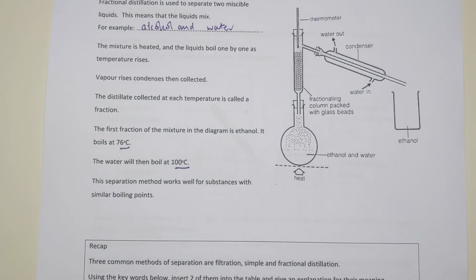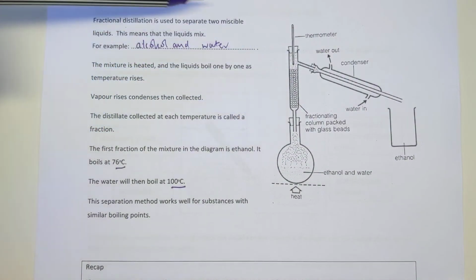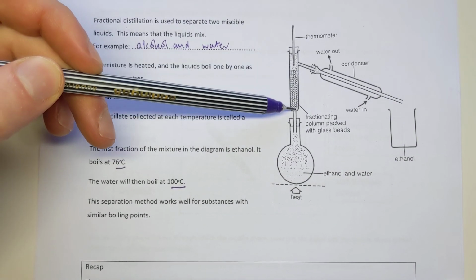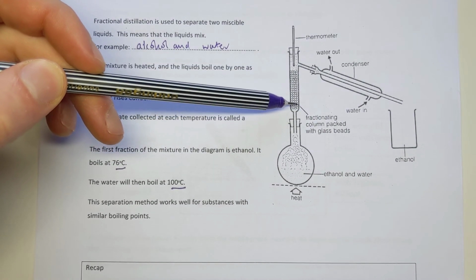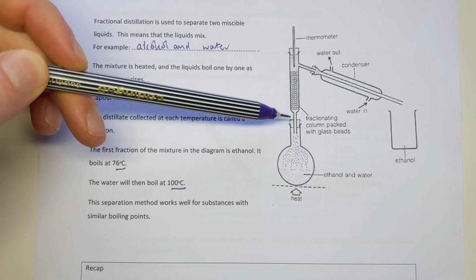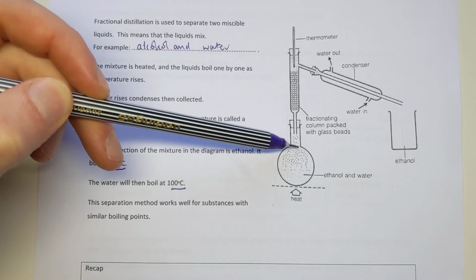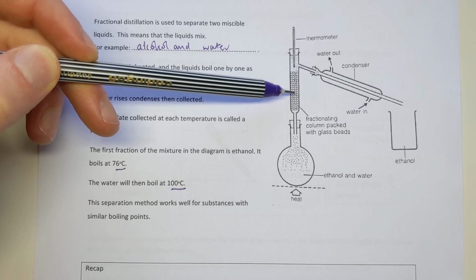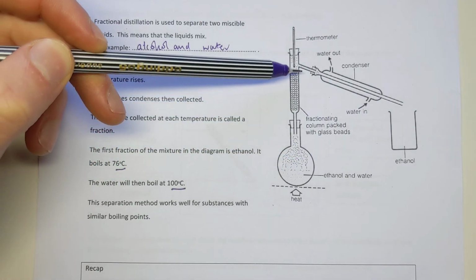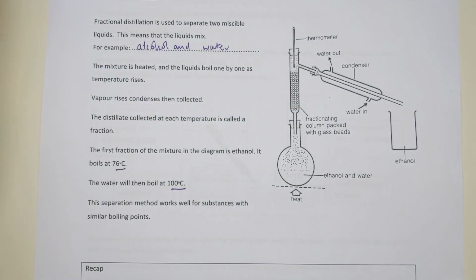The difference with fractional distillation is this piece of apparatus here. It's known as a fractionating column, which is where fractional distillation comes from. It looks quite complicated. It is just a long tube which has kind of like lots of glass beads in it. The reason this bit's here is for one purpose. It makes it more difficult for a gas, a steam, to work its way to the top. So in other words, it's more effort for a gas to get from the container all the way to the condenser. That makes it better at separating out the two liquids.